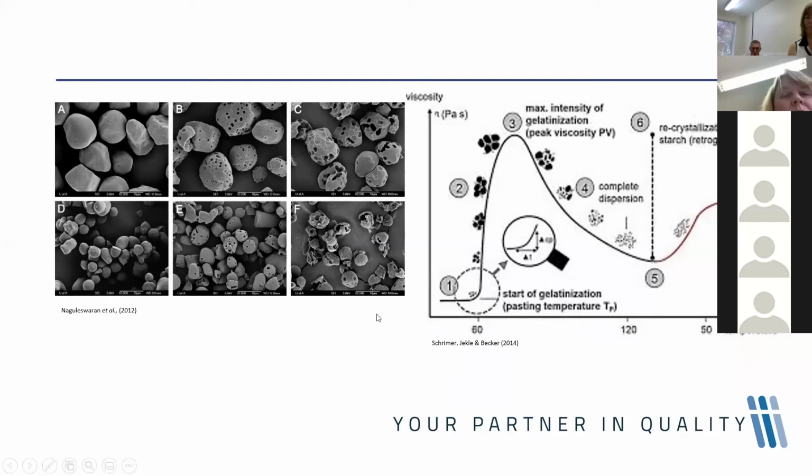As your starch granules are exposed to water and heat, what tends to happen is they expand. They take in that water and they start expanding. And this is exactly what contributes to the thickening effect of starch, which happens during the test.